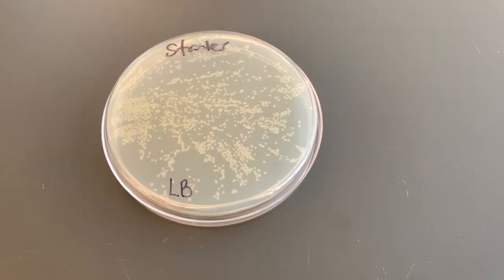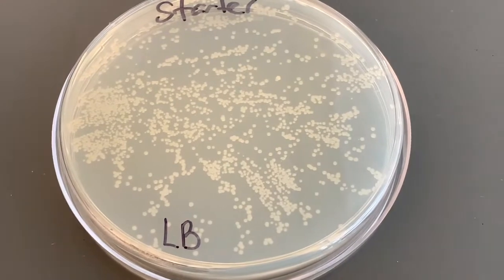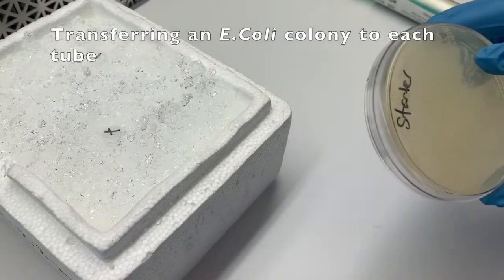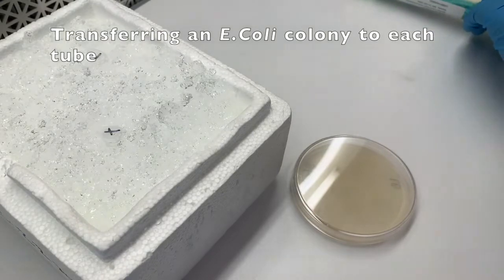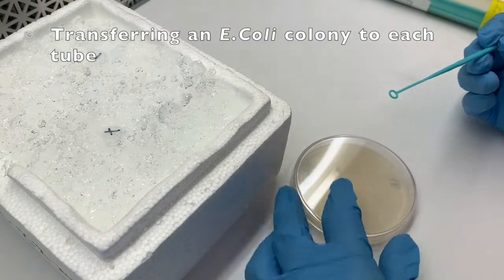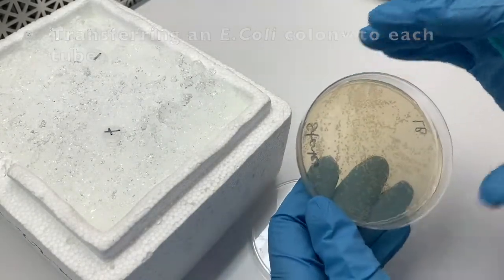Next, you're going to want to pick a colony of bacteria. Each one of those white spots is what we call a colony of bacteria. It represents perhaps a billion bacteria that descended from some parent cell that had landed on the plate about a day ago and then grew on the light brown growth medium. You're going to pick one colony at a time and put one colony in each of those test tubes you prepared before.